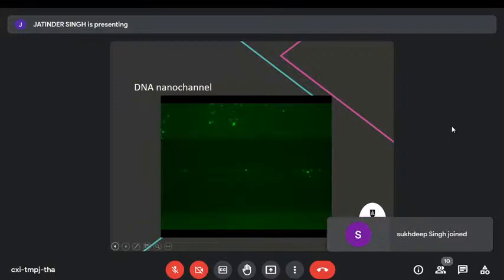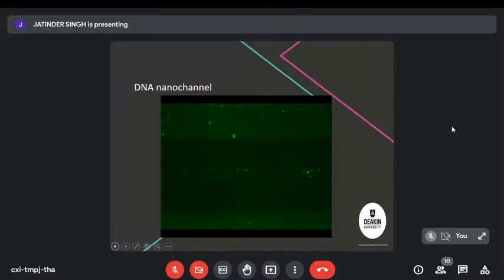You can see the DNA coming in. It ends up in the nanopore and from a blob that is folded all up, from being a blob-like molecule, it stretches out because the nanopore is very thin and finds its way through a nanopore in the electric field. So you can see the blobs moving, bits of DNA come in, and they go through the channel. And as soon as they're out in a non-confined space again, they curl up to their preferred equilibrium configuration.